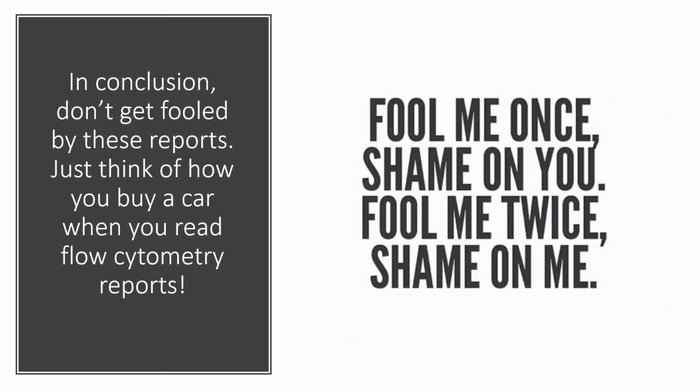So in conclusion, don't get fooled by these reports. Just think of how you would buy a car when you read these reports. When you buy a car, you need to know lots of information. You need to know it has a V6 and not a V8, that it's red and not white. All of those things go into flow cytometry reports as well.